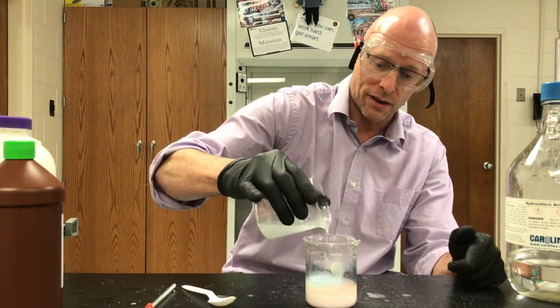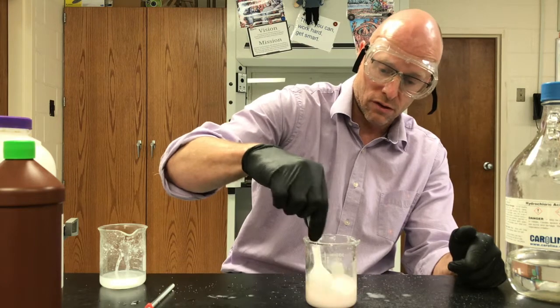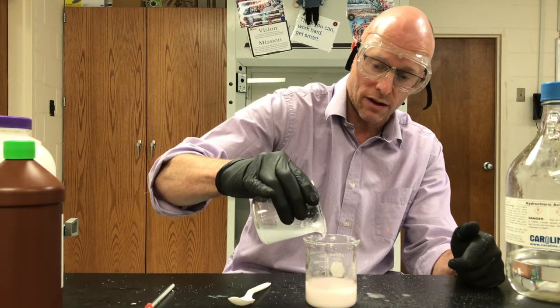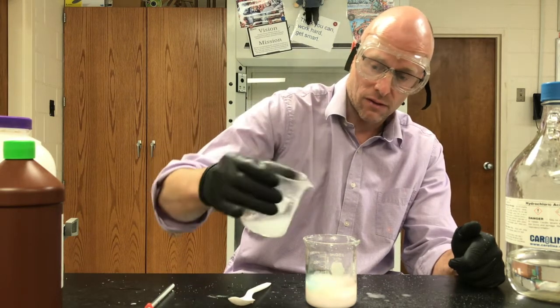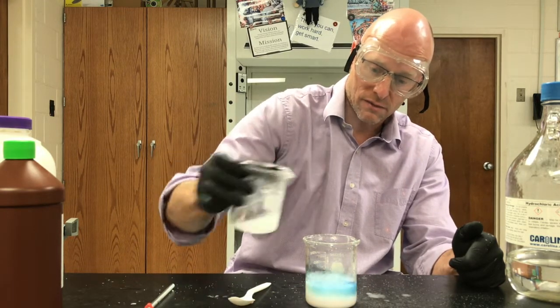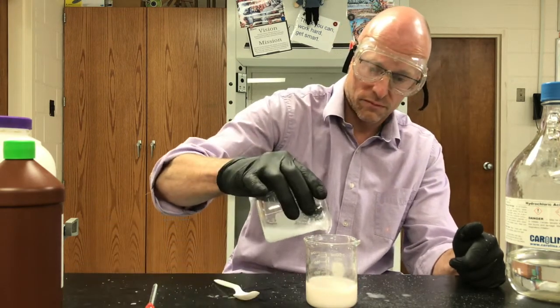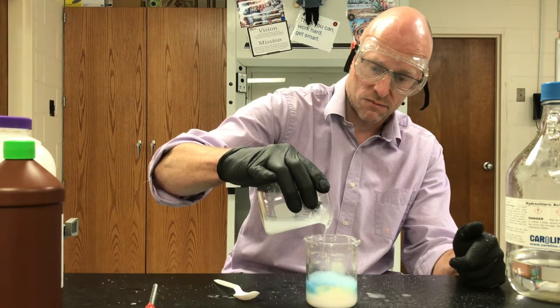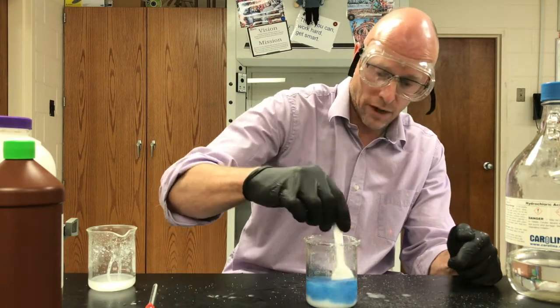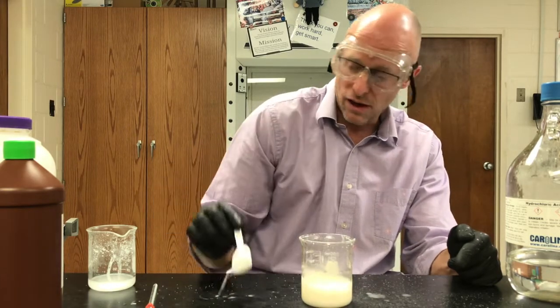You can see the blue color forming there, which means the bromothymol blue is showing me I'm getting base at the top. But when I mix it up — we got blue. That milkiness there is salt forming; we're making sodium chloride. I'm hoping we've got enough to neutralize this acid.